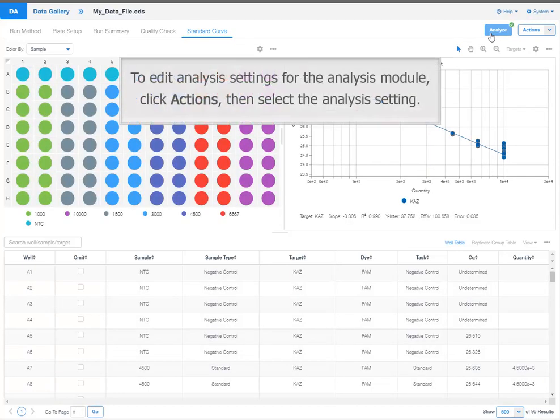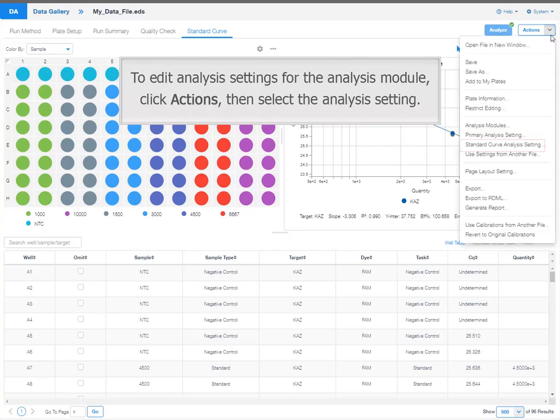To edit analysis settings for the analysis module, click Actions, then select the analysis setting.